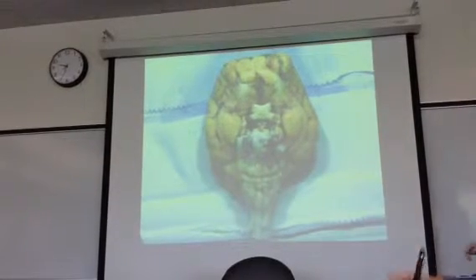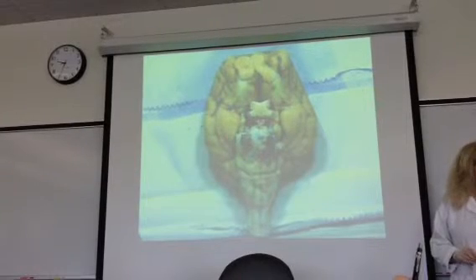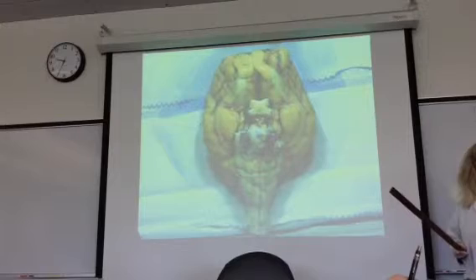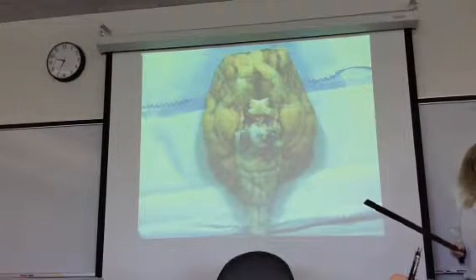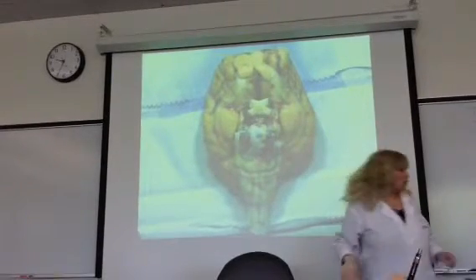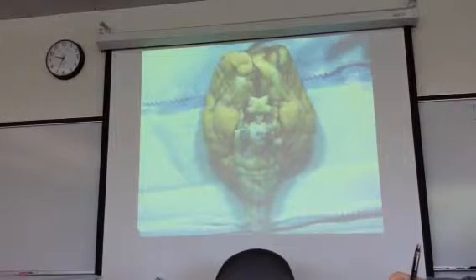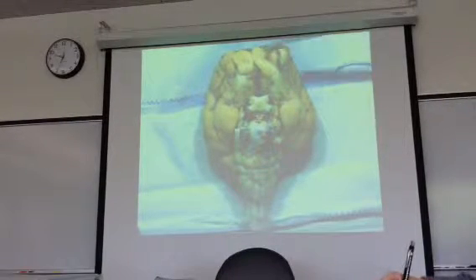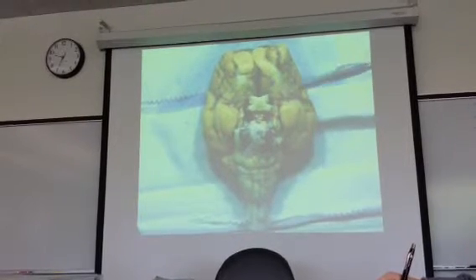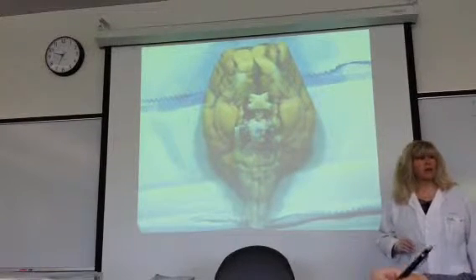All right, there are only limited cranial nerves that you have to learn on the sheep brain. The first set, you can't even see the actual nerves. You can only see the structures in which those nerves are embedded. See these sort of round flappy things right here? I'll show you, they're a little bit loosely attached. See right there? Running through here, all the way through, are the first pair of cranial nerves, olfactory one.